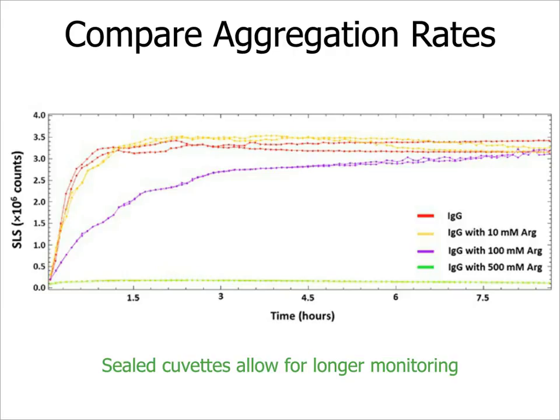And experiments of this duration are only possible because we seal our samples in the unis. So determining kinetics is a useful way of determining potential degradation optimization mechanism.